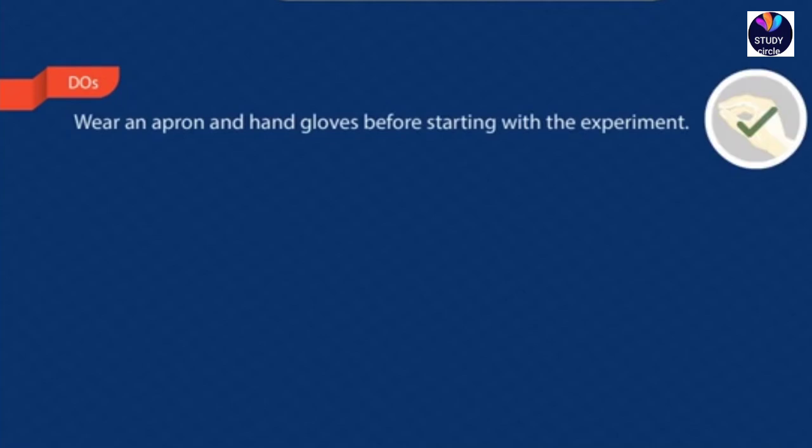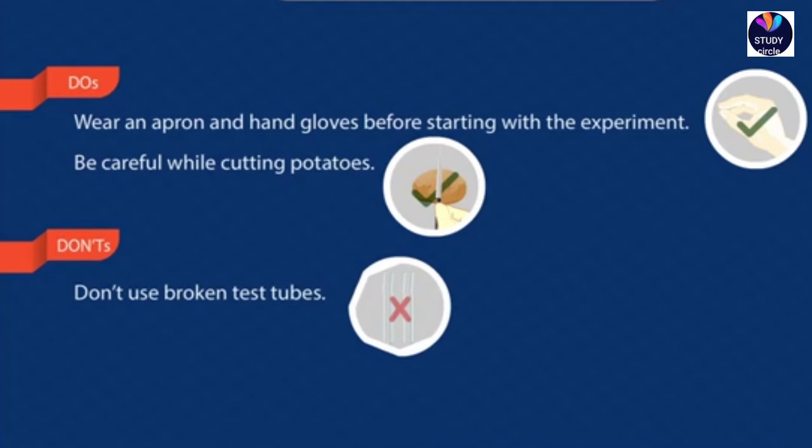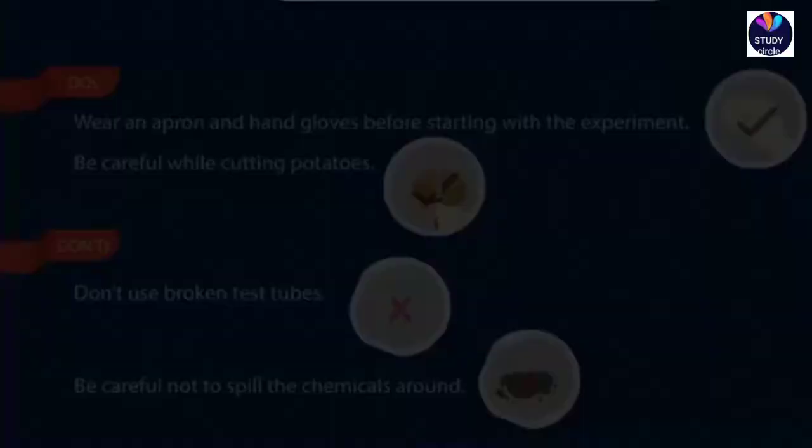Do's. Wear an apron and hand gloves before starting with the experiment. Be careful while cutting potatoes. Don'ts. Don't use broken test tubes. Be careful not to spill the chemicals around.